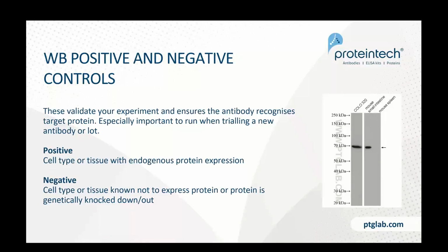So again, I just want to highlight the importance of positive and negative controls. For positive controls, we recommend really any cell type or tissue with endogenous protein expression. Great resources for finding good positive controls are, one, whatever cell types or tissues the antibody manufacturer uses, and the second one is online resources such as PaxDB and uniprot.org. Both of those are able to tell you which cells or tissue types express this protein.